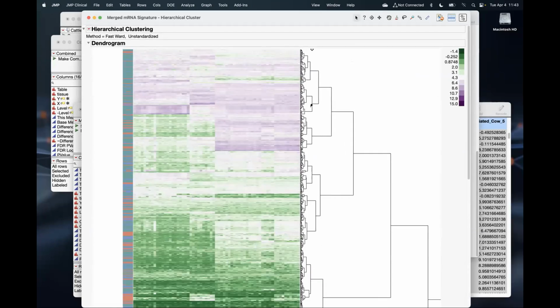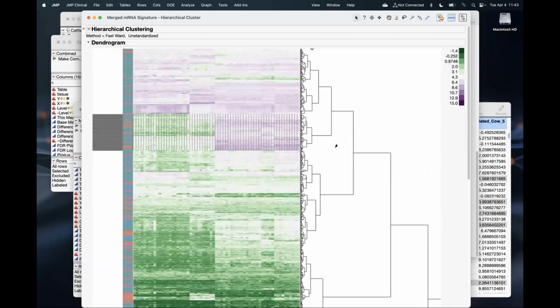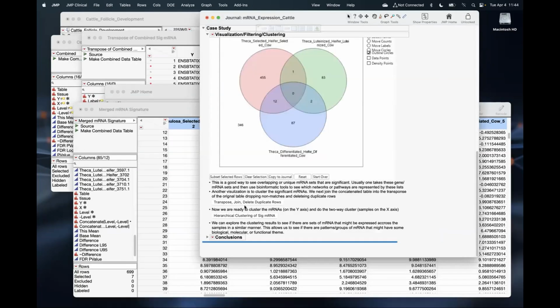And then I'll see there are sets of genes that are meaningfully different between the two tissues, which is probably tissue-specific differences, right? And within that, you might see some small subsets too. Within those tissues, you might see those that are probably luteinized. Sure enough, those are genes associated with being at a stage of luteinized versus the others. And that's just, again, good to know. You can see these obvious differences here too. And that's what I have to show you for this.